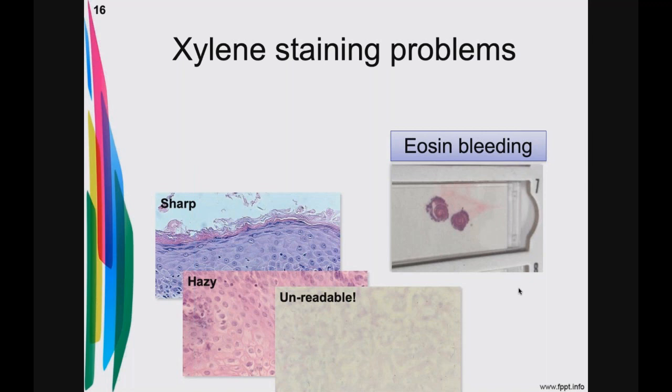Now, another thing that could happen when you still have water underneath, you may not see it. The pathologist sees this immediately. What they'll find is that with that small degree of water, while they're trying to read the slides, they can't read it. It's not sharp. The mixture of mounting media, water and xylene is a mixture that the objective of the microscope does not zoom in on, and instead you get hazy looking slides.